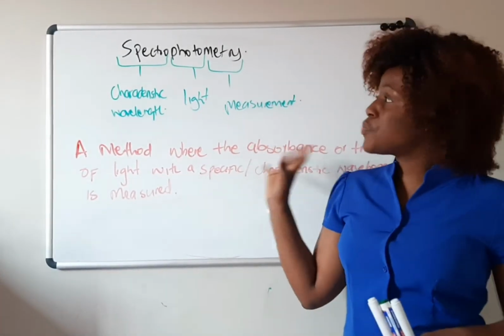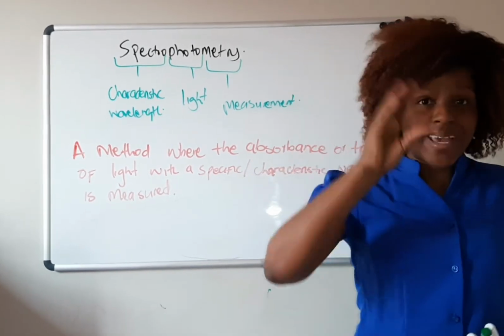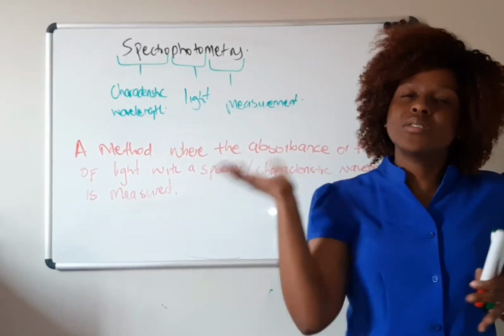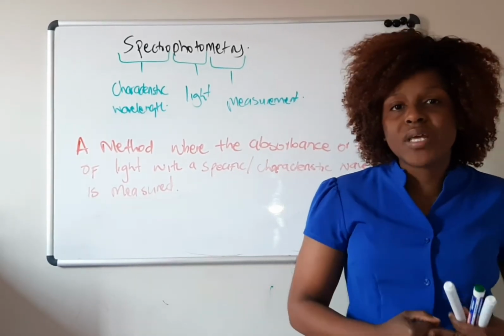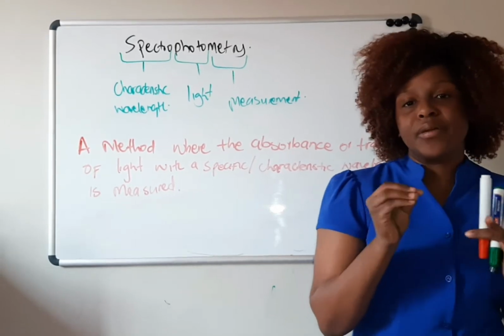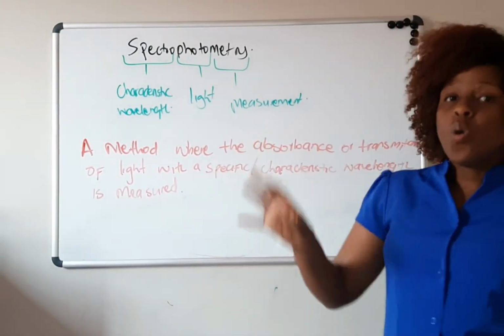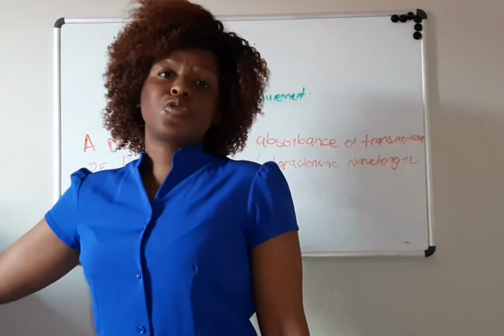With spectrophotometry, there is usually a spectrophotometer inside the instrument. Most of the methods that we're still going to talk about also use the spectrophotometer, even if the principle might be a little bit different. You'll find it will still be a measurement of either transmitted or absorbed light. So what are the components of a spectrophotometer?